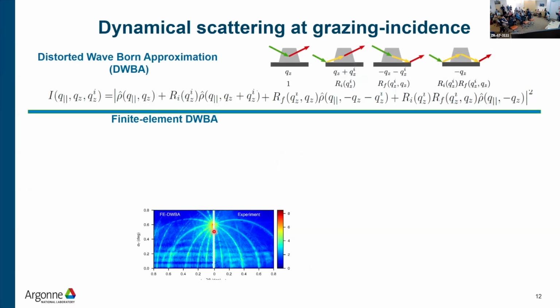Okay, so far, the reconstruction algorithms we use for CDI and ptychography are all based on conventional algorithms, which only deal with a single scattering event, which means kinematic scattering or the Born approximation.